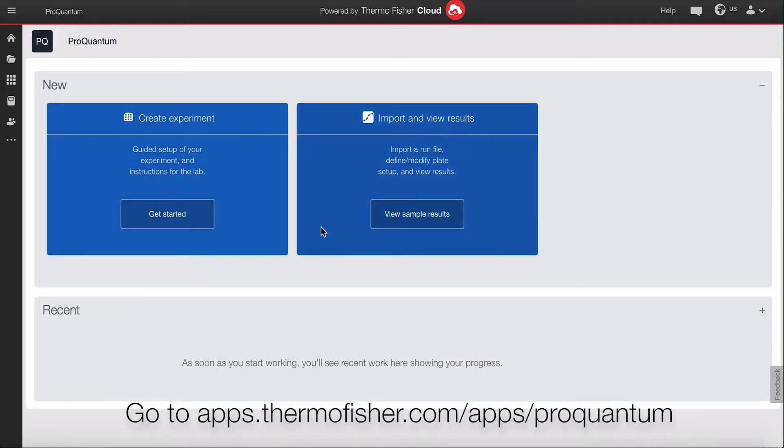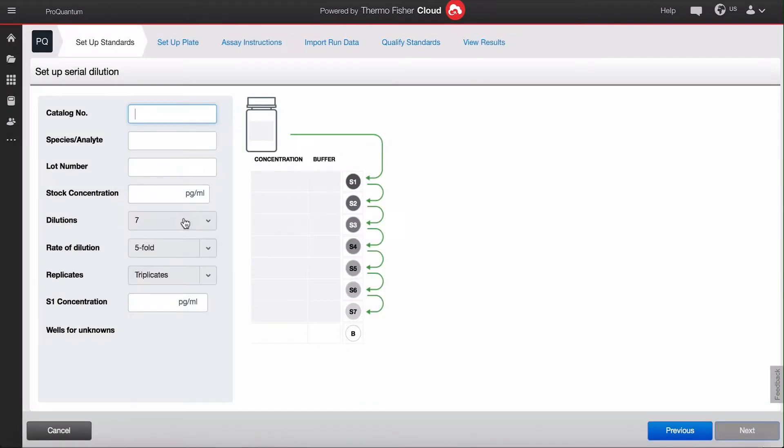When you open the app, click on get started. The software supports you with a standard curve setup wizard. When you type in the kit catalog number, there will be a default setting.